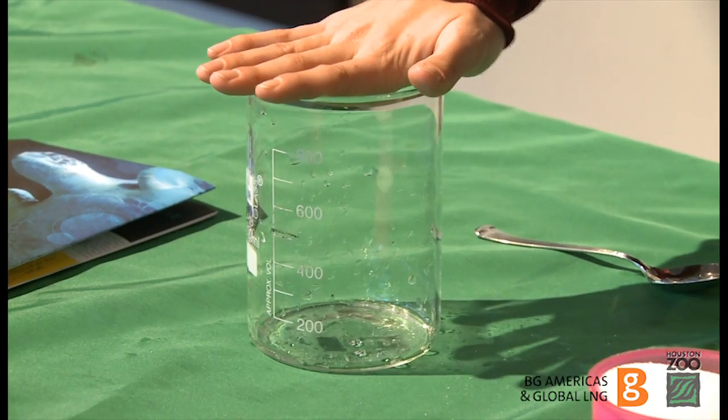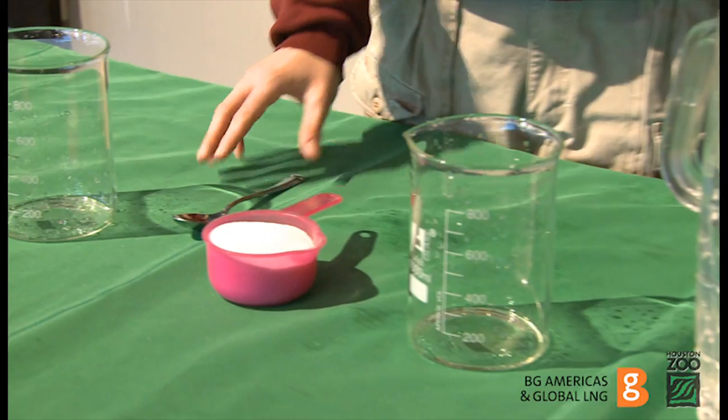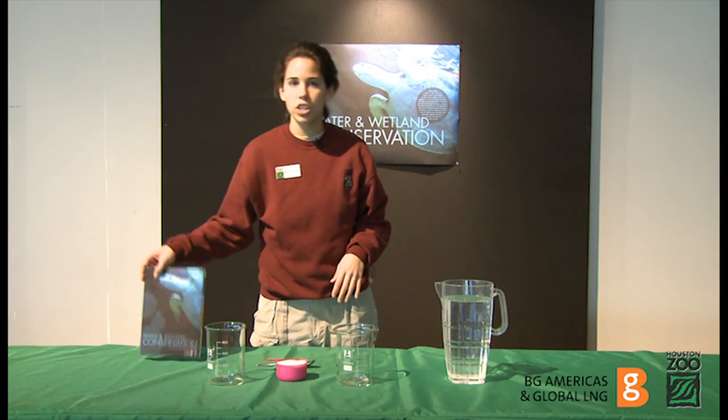For this experiment you're going to need two large glass beakers, one cup of sugar, a spoon, and also some water. You'll also need to have the worksheet and the handbook out so you can reference that throughout the experiment.